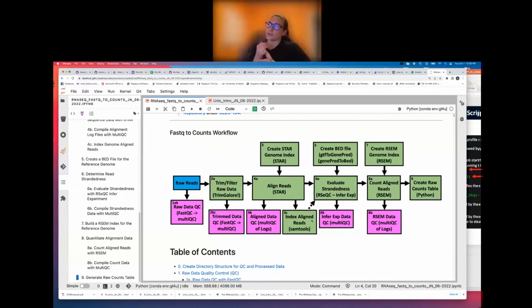The other things that we have for controls is every time, at least in-house at GeneLab, when we sequence RNA-seq samples, we always include a universal RNA reference sample. There are universal RNA reference samples that are available, at least I know one for human and one for mouse. So for our mouse studies, we will usually include a universal mouse RNA reference and take a look at the expression of the genes in there, because we have an idea of what the expression of those genes should be if they're well documented.